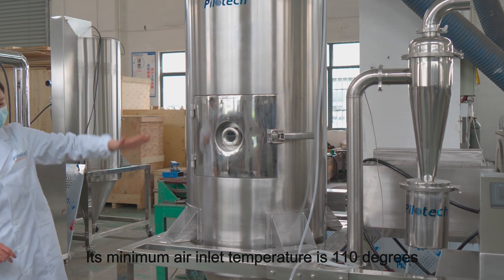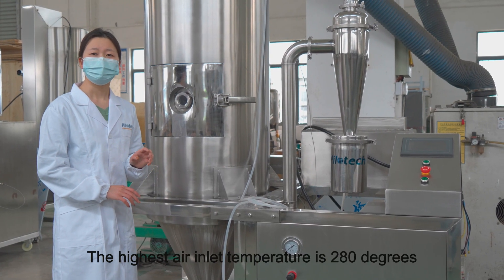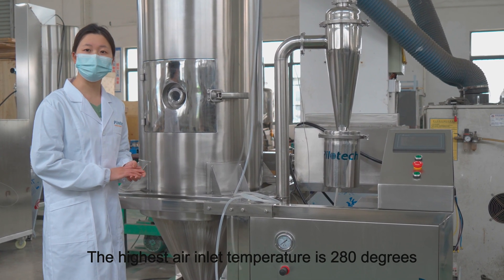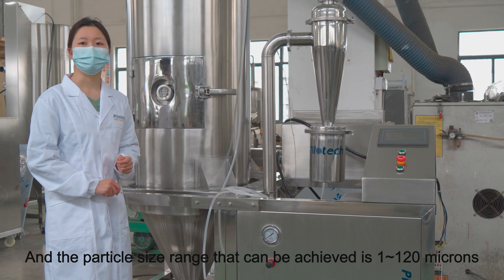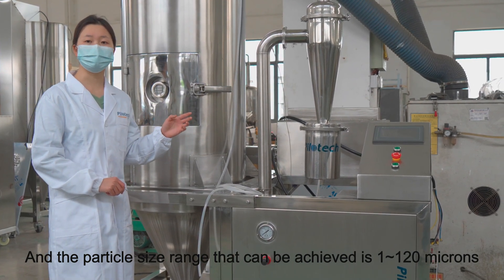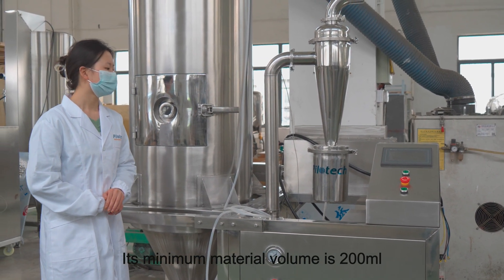Its minimum air inlet temperature is 110 degrees, and the highest air inlet temperature is 280 degrees. The particle size range that can be achieved is 1 to 120 microns, and its minimum material volume is 200 ml.